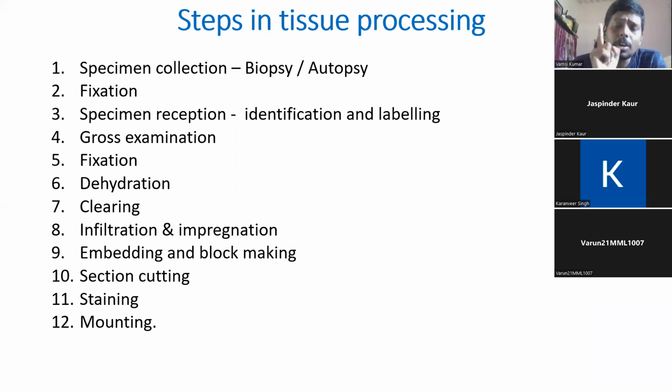So we must always take a photograph of the gross sample. Only upon taking the photograph must we proceed to the next tissue processing steps. So now you understood why the gross examination is important?